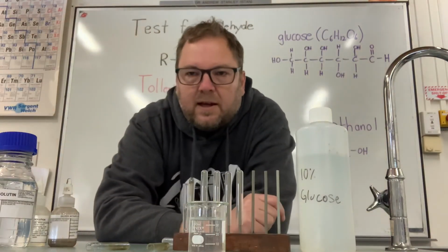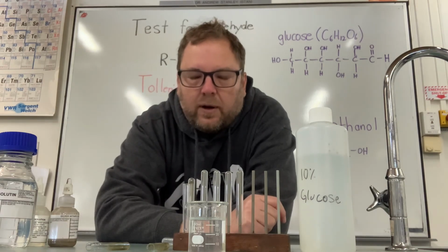So that is Tollen's reagent and the test for aldehydes.